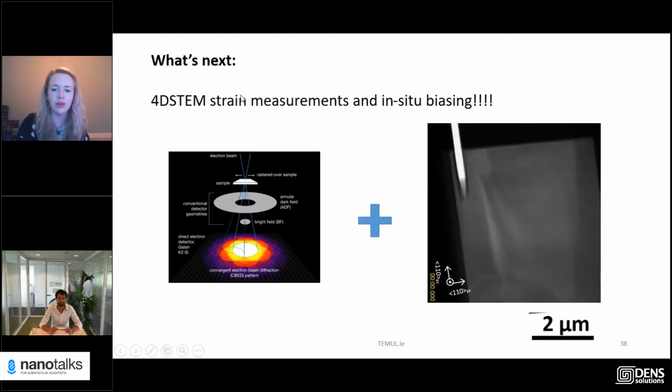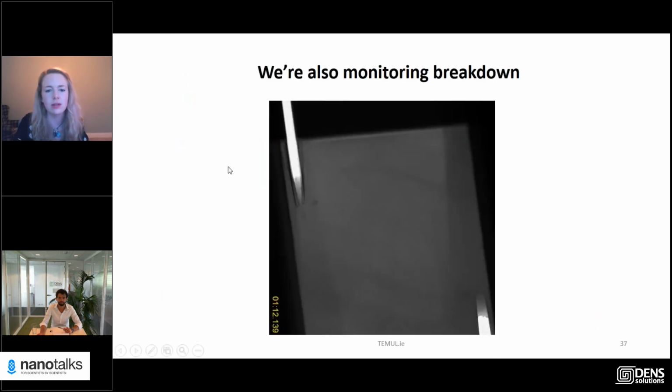So then what I started doing, and maybe the other slide might show that better, is cut here and then cut here. This is where the platinum layer is up at the top. The reason I did that was so that, plus or minus, whatever the applied voltage, it would flow through the material and then up through the contact that way.